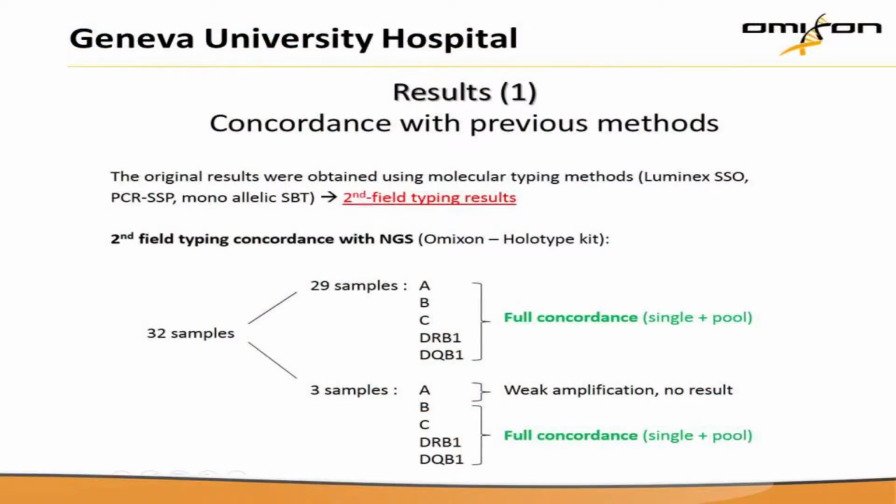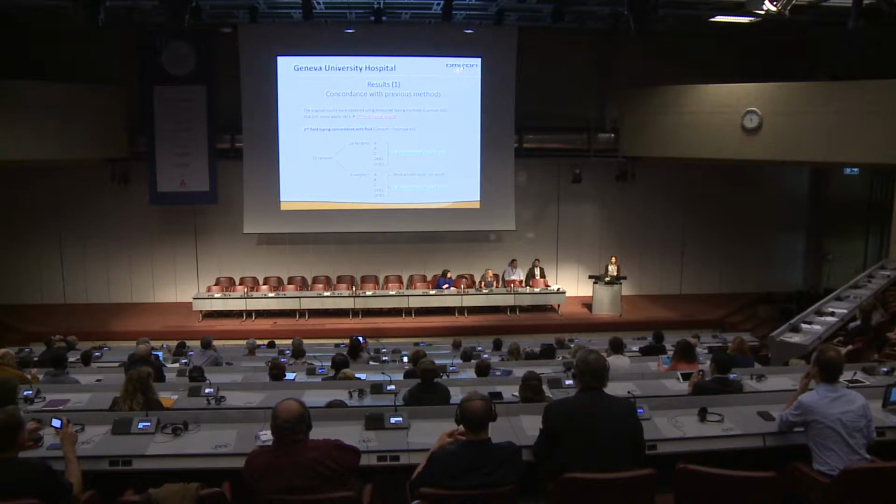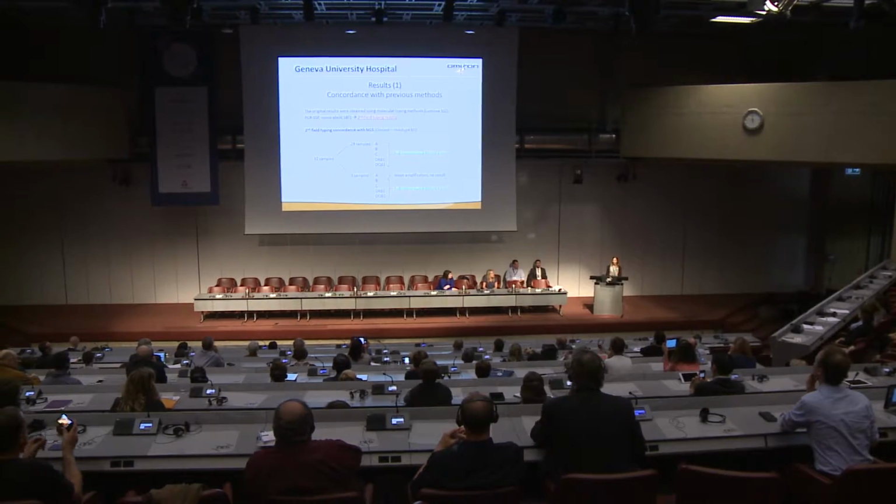The first result I wanted to present is the concordance with our previous results. Every sample has already been typed with other typing methods such as Luminex, such as PCR. So here I will talk about only the second field typing.